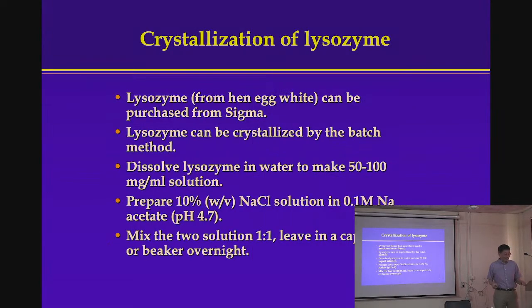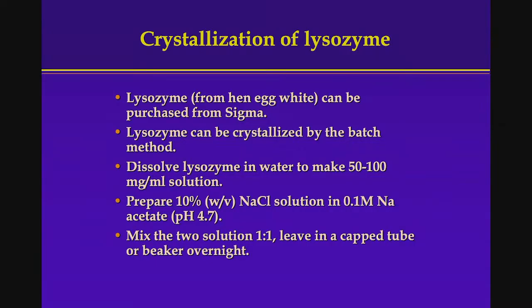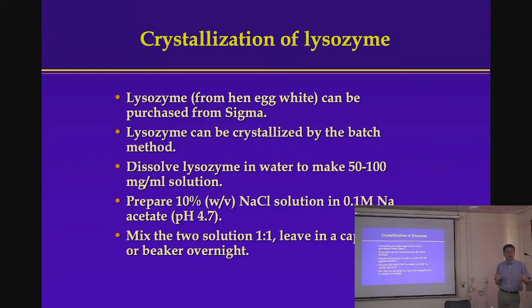Keep on doing that. So as I mentioned, lysozyme. We'll say that a few times, because lysozyme is the test crystal for crystallography. Because it crystallizes so easily, it diffracts X-rays like crazy. So lysozyme is used to make sure machines are working correctly.